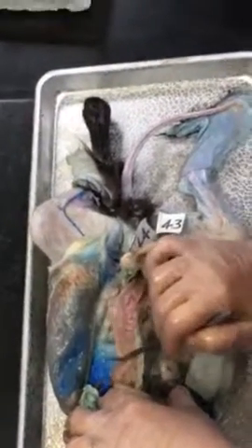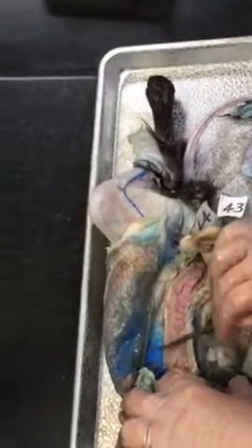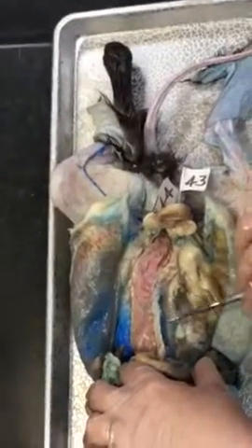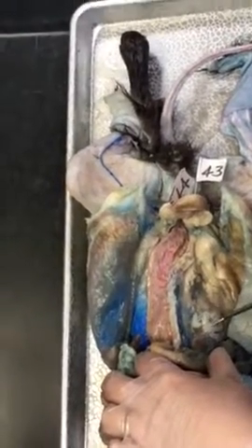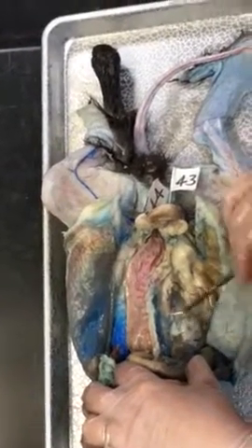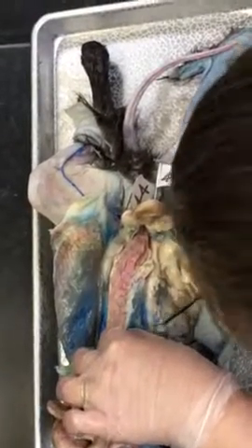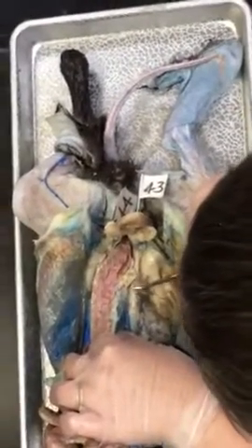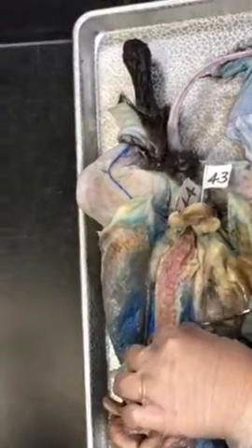All right. Now this is quite common for cats. You see this giant ball of blue? That's a latex explosion. That's where the kidney is. Here's the other kidney. And when they're injecting the latex into the veins, there's such a change from the large vessels into the small vessels of the kidney, they tend to rupture. So that's why we have the blue latex there. And if you come down, see it here. It's not dissected out very well. There it is.